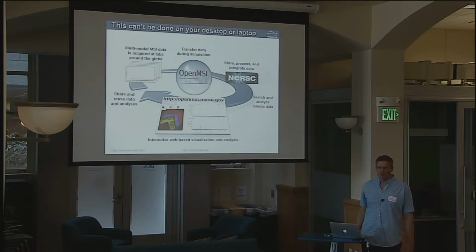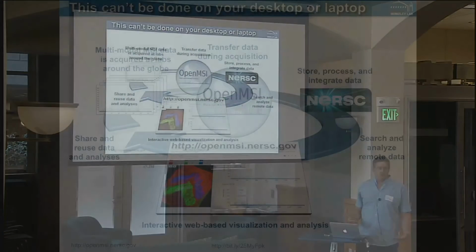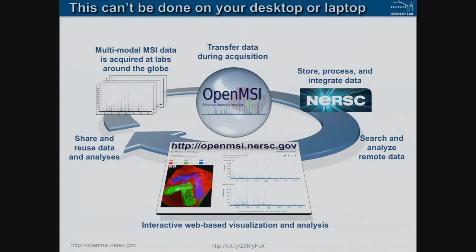They could do this with a tool I built with Berkeley Lab called Open MSI. You would need a supercomputer, obviously, to do this. You can't do it on your laptop.